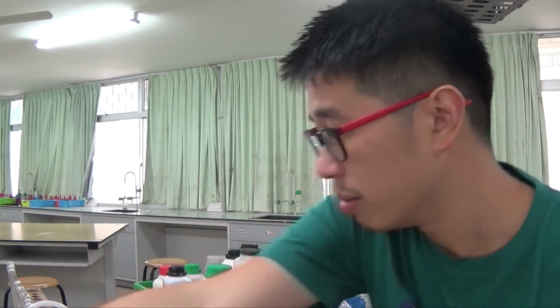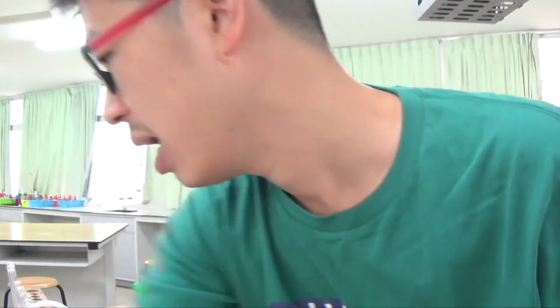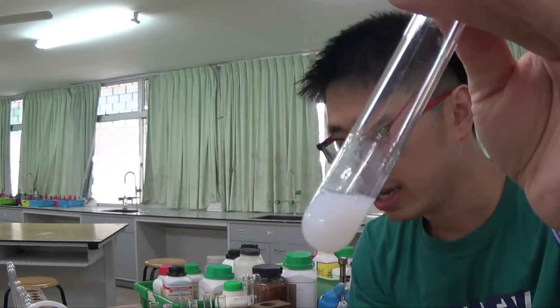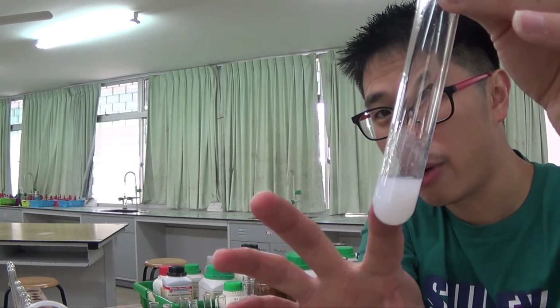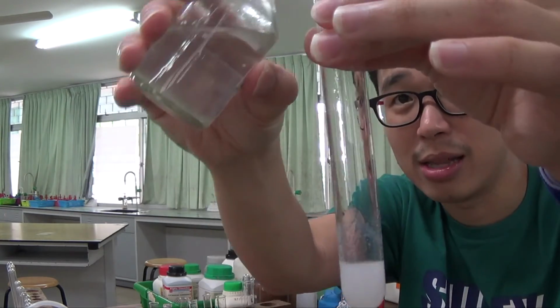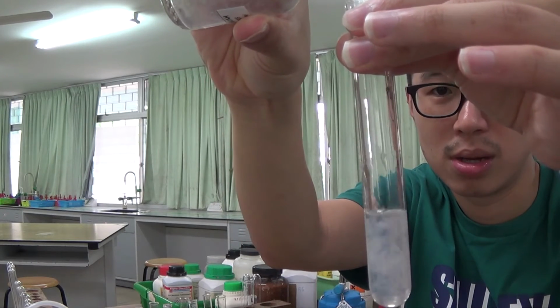Oh no, my hand got a bit of hydroxide in there. Anyway, aluminium hydroxide is insoluble in a little bit of sodium hydroxide. But see what happened when I add in excess. This one is a lot of white precipitate because I just added a lot of the concentrated stuff. So my feeling is I need to add quite a lot of sodium hydroxide in order to dissolve this.